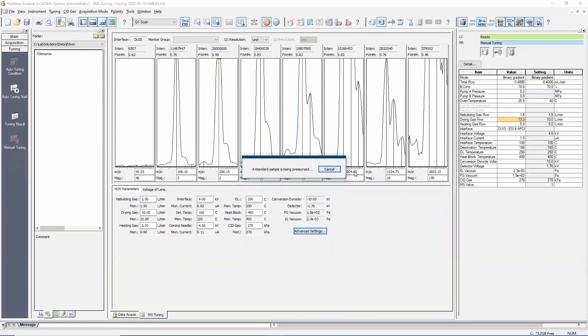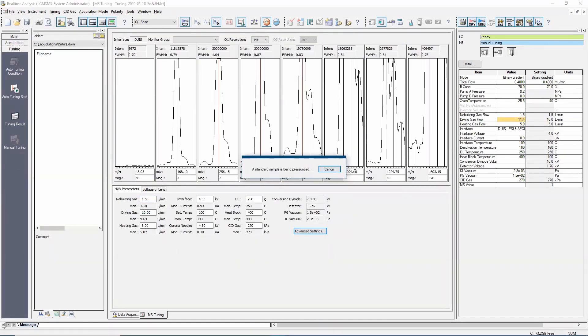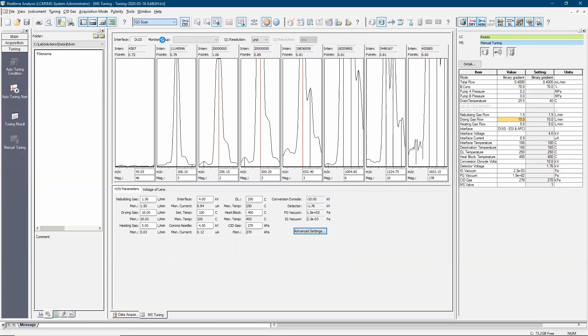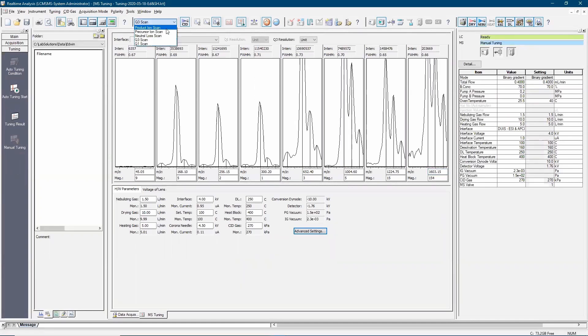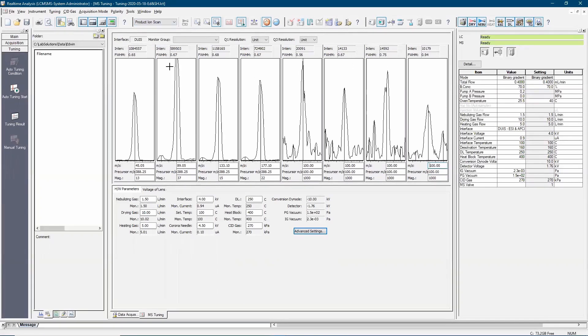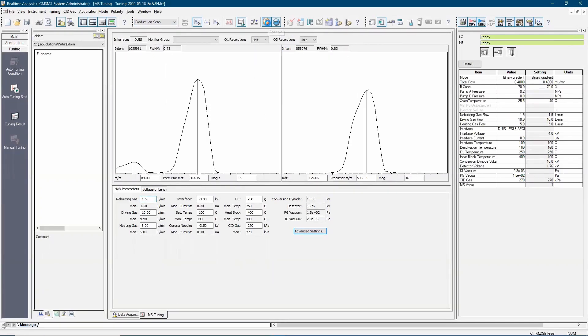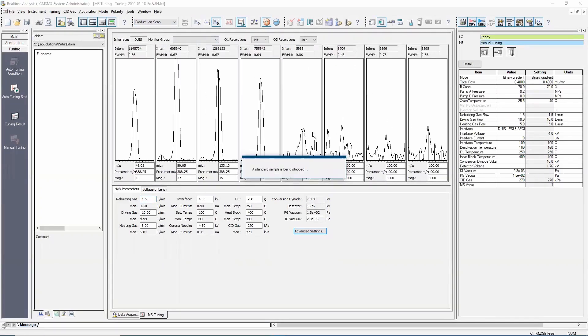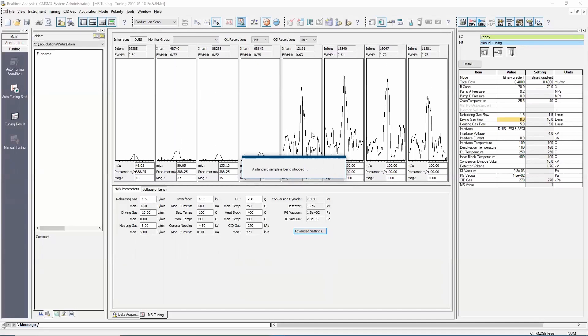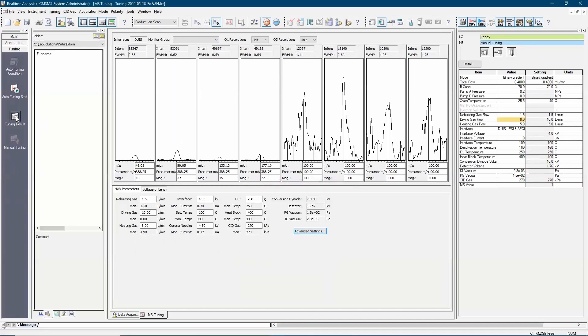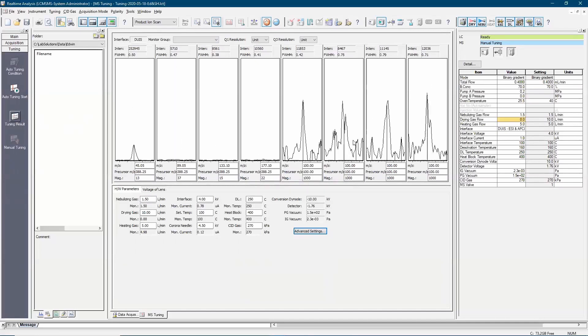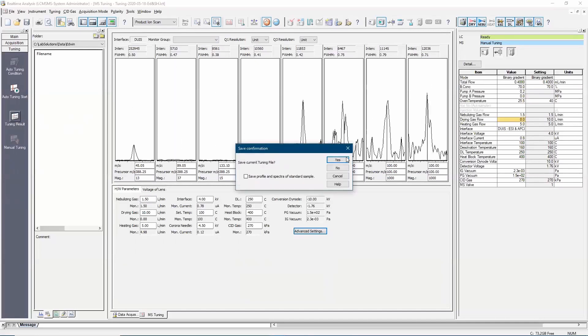Check for the peak signal to ensure that tune solution is able to flow from sample bottle to the ESI probe. Click on tuning result icon to stop the check.